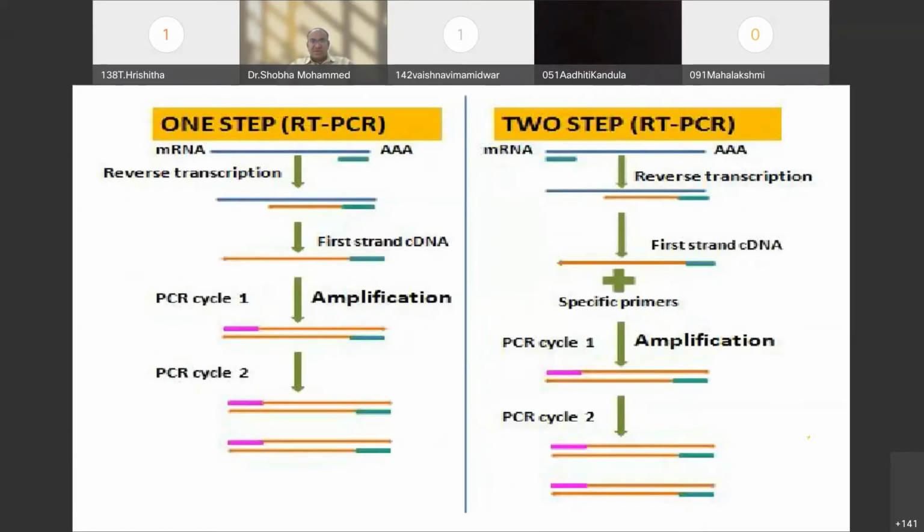This one also I told you yesterday: the reverse transcriptase. Generally, we had an idea that having a DNA, only from there can I synthesize it. But we can synthesize the DNA by using the messenger RNA. Now, it's very important what the messenger RNA contains. It's nothing but the sequence of the amino acid codes which will help in the synthesis of the proteins. So this mRNA will definitely have the nucleotide strands. By using this part, I can have the synthesis of another DNA in the PCR cycle, so that I use the specific primers. This is the point I need to understand.